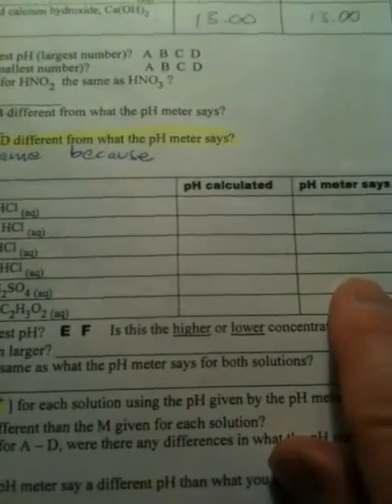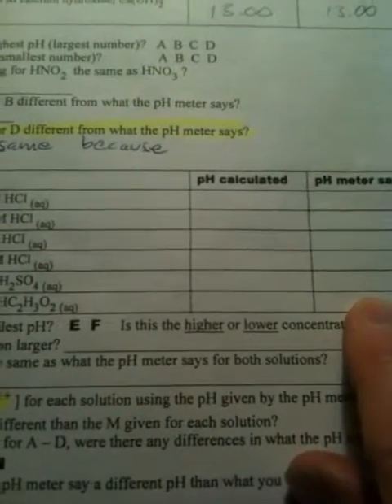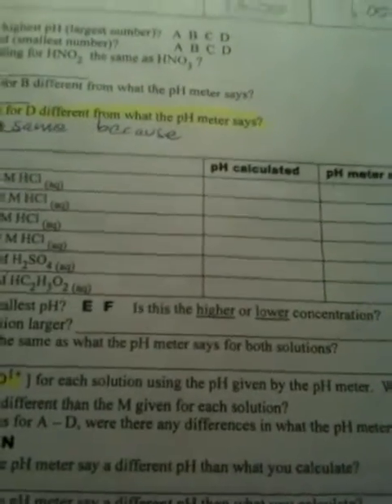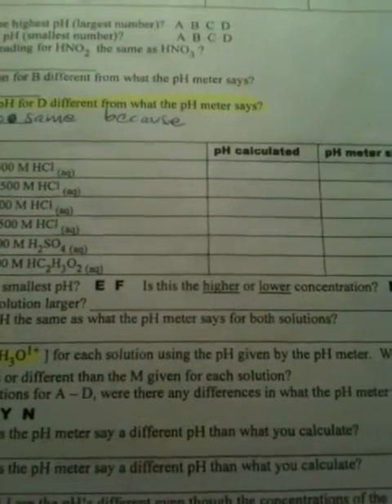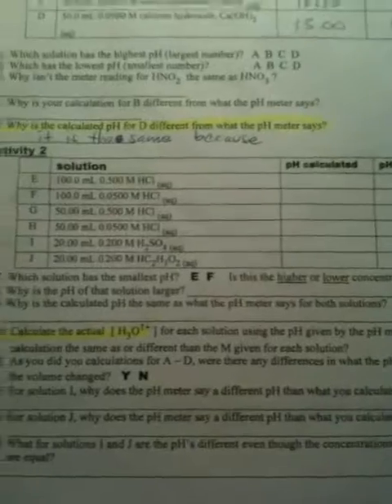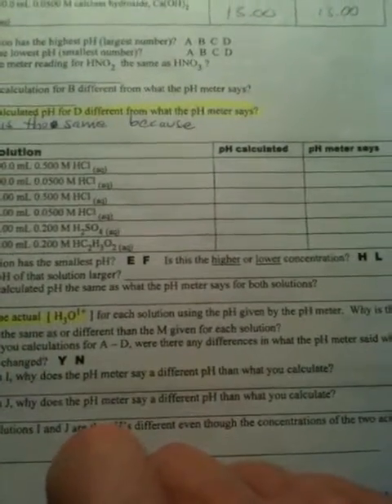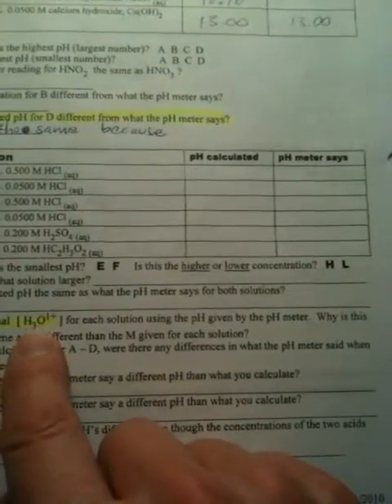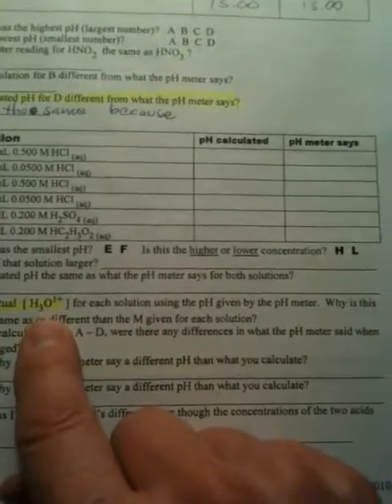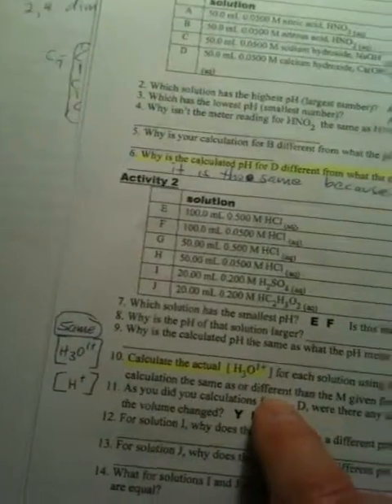So in that case, we're doing the anti-log, or we're finding the concentration from the pH, which is the same thing. Look, if you don't know how to do that, I have a video that shows how to do that, and you can see that on the homework page. That will be available for you tonight. In fact, it's up before I made this one. So you're going to calculate A, B, C, D, E, F, G, H, I, J. You're going to calculate the hydrogen ion concentration from the pH. So that's what your job is in that part of the lab.